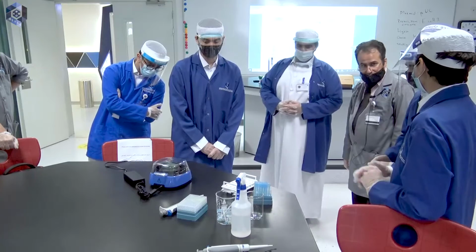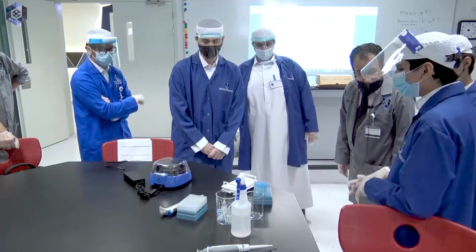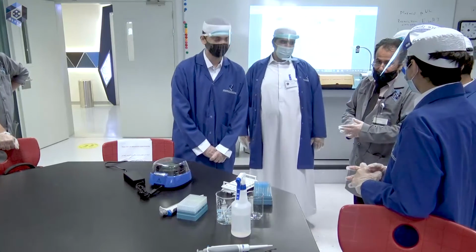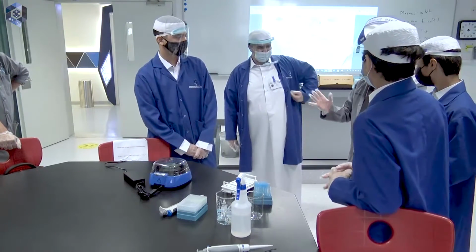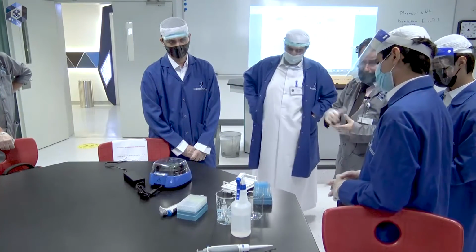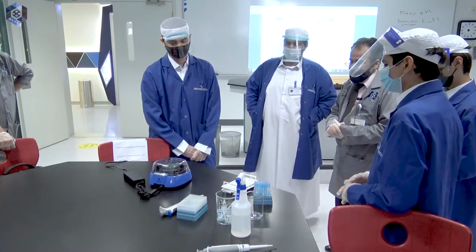Even if we put different colors, it becomes white. They will not mix together. They will get separated if you have different dyes, different stains, according to their density.